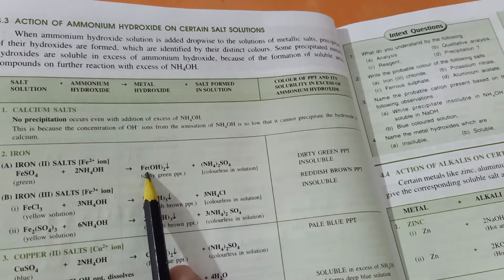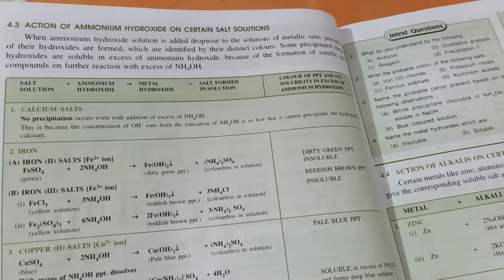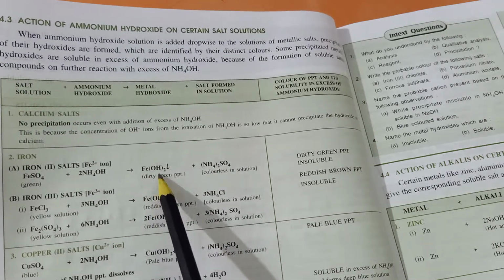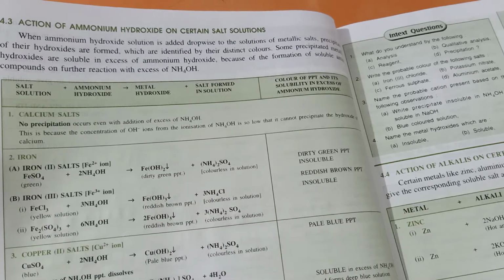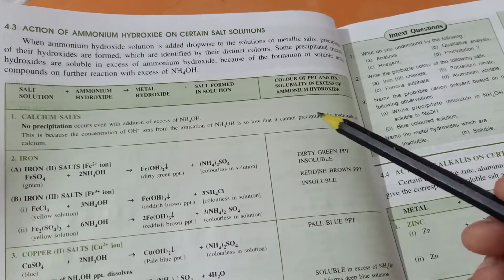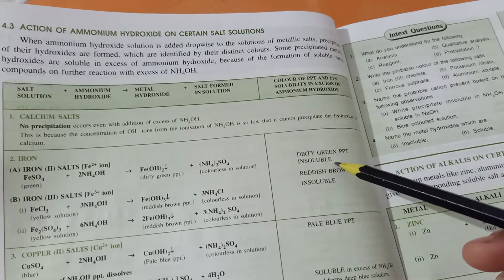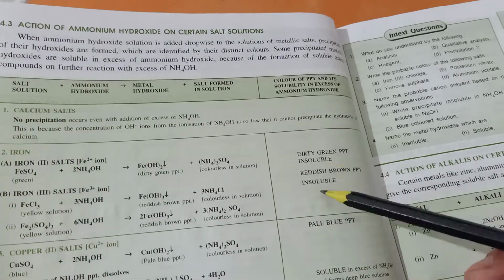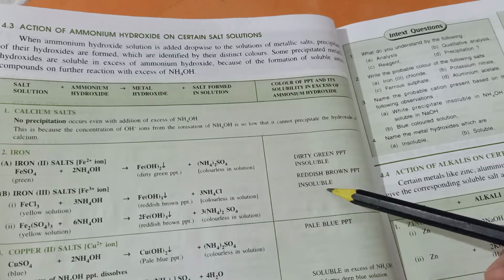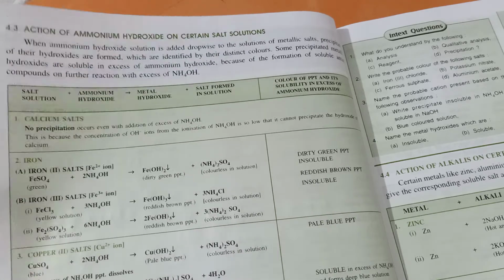Now this ferrous or iron 2 hydroxide is dirty green like it was with sodium hydroxide, because the hydroxides formed in both cases are the same, therefore their color will also be the same. With further addition of ammonium hydroxide, that is in excess case also, here also both the hydroxides or precipitates are insoluble. Okay, in sodium hydroxide also both the precipitates were insoluble.